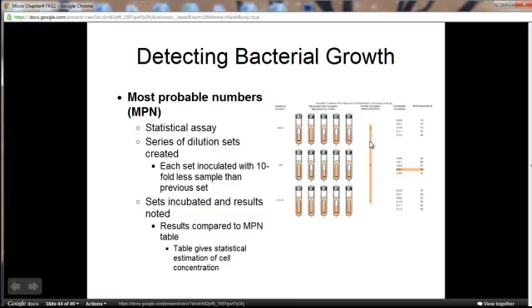So we put the little tubes in here, we're going to expect gas to be captured, particularly because these organisms are going to grow at the bottom of this tube, and as a result of that, they're going to be producing gas through fermentation. So ultimately, you add your water samples to these 15 tubes, and then later on, you're going to count the number of tubes that end up getting a bubble. And the more tubes you have that have bubbles, the more fecally contaminated your water source is, and that's estimated using a number called the MPN index. So the higher the MPN, the nastier your water is.